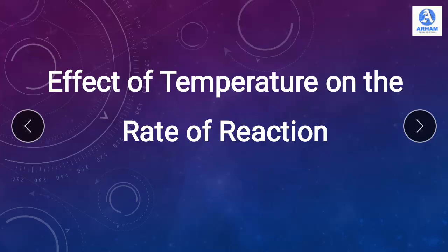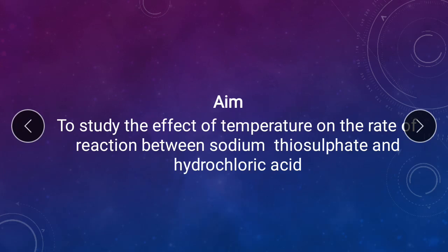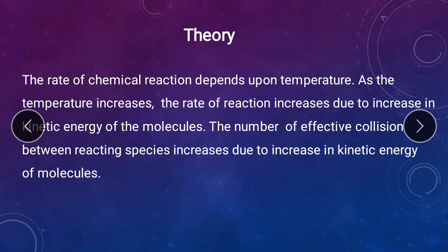Hello dear student, today we will study the effect of temperature on the rate of reaction. The aim of the experiment is to study the effect of temperature on the rate of reaction between sodium thiosulfate and hydrochloric acid. Before going to the procedure, let's discuss a few points related to rate and temperature.